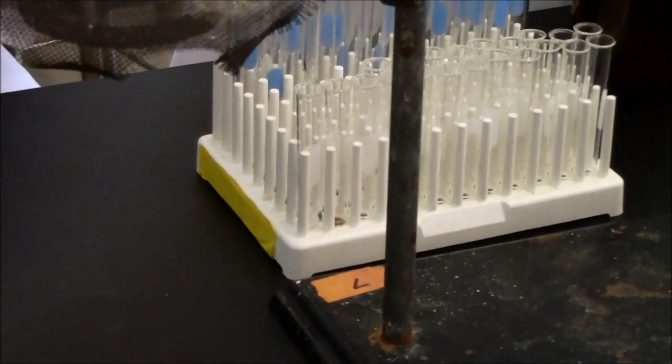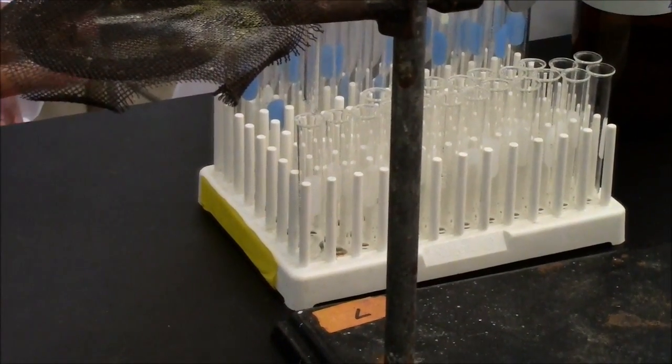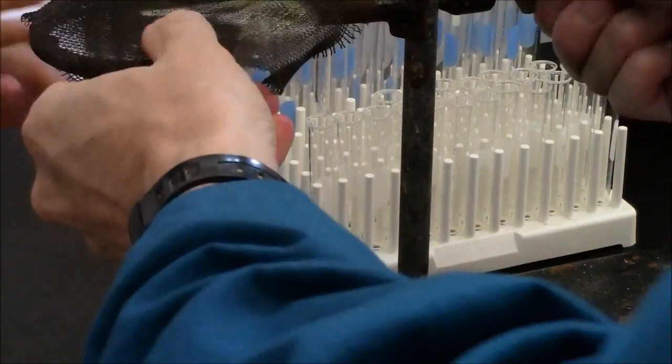All right. So this is now collecting fraction number 1, big fraction at the bottom. I just want to let you know.